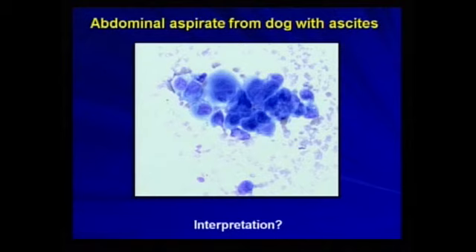And then we have something where you can see these cells are hugging each other and the nuclei are folded over each other. This is referred to in the literature as nuclear molding. I had a lot of trouble with nuclear molding until someone recently observed that these cells are spooning.